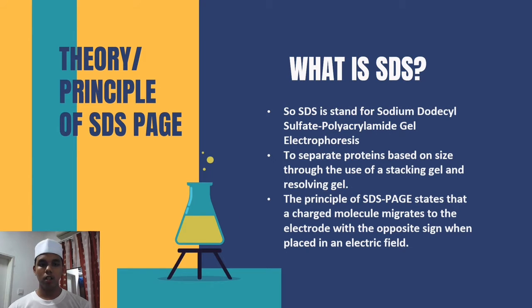Next, theory or principle of SDS-PAGE. So what is SDS? SDS stands for sodium dodecyl sulfate polyacrylamide gel electrophoresis. The theory behind SDS-PAGE is to separate proteins based on size through the use of a stacking gel and resolving gel.